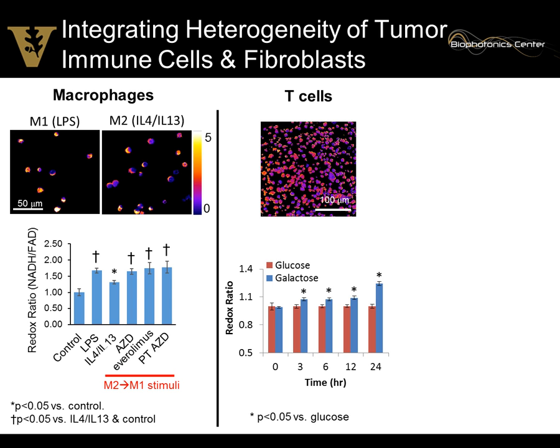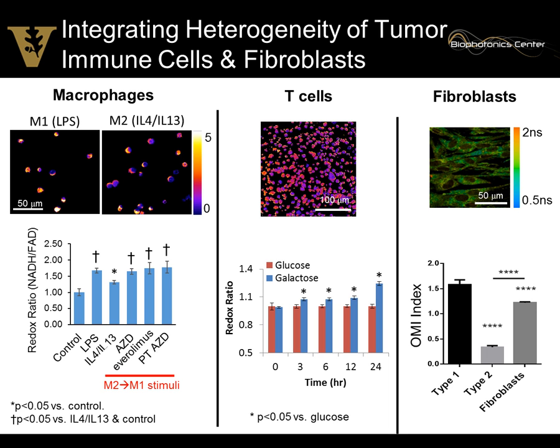So this is true especially in T cells. They develop different metabolism to gain effector function. So we can be very sensitive to the behavior of these immune cells. And we're all doing all these studies in a dish right now, but eventually the goal is to use what we learn in culture and apply it to our in vivo imaging so that we can understand the immune response using our metabolic measurements. And I think I already talked about fibroblasts and their importance.